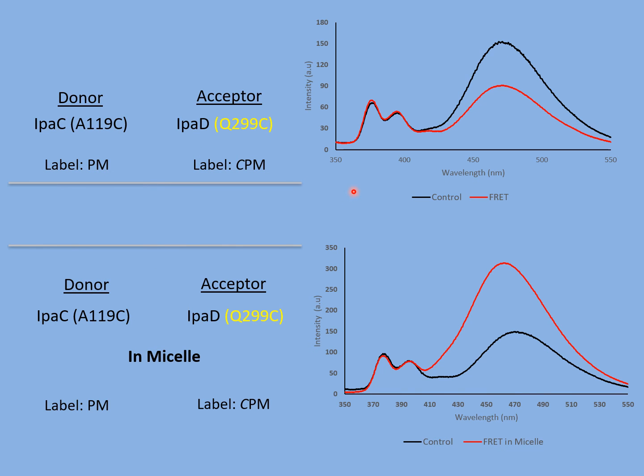Okay, so I saved the best one for last. This is the closest results to a positive interaction I got. And what we're seeing here is a very close relationship in the experimental FRET without a micelle. This is technically negative because it's slightly above. And then we also see a negative result here. So it's a negative interaction, but it's close.